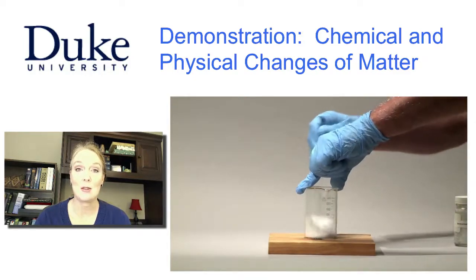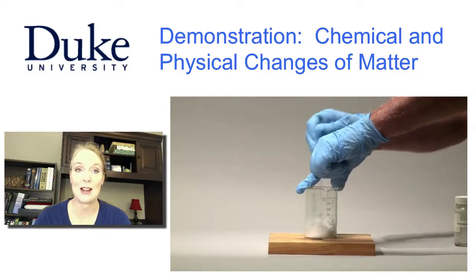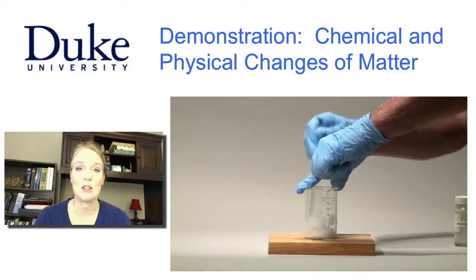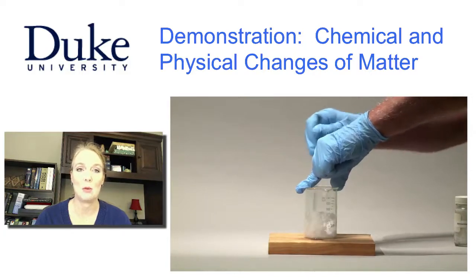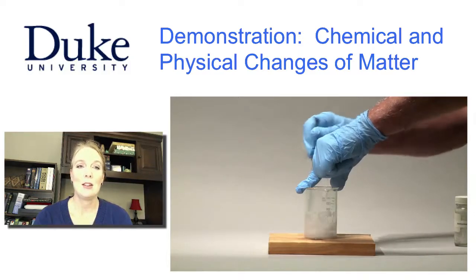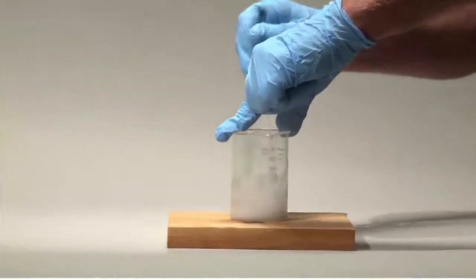This particular reaction is an unusual reaction because it occurs between two solids, and often solids tend not to react very quickly with one another. What do you observe happening to the mixture as he's stirring it?